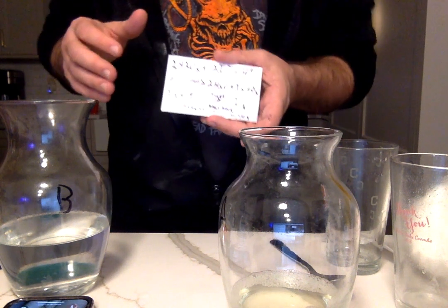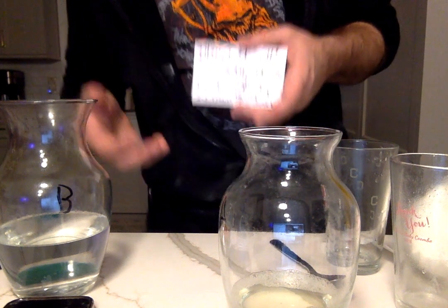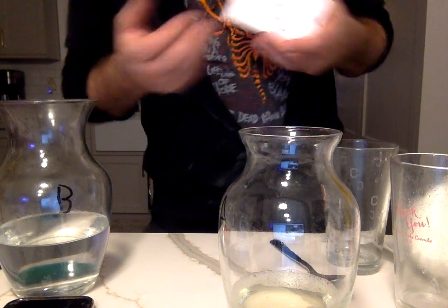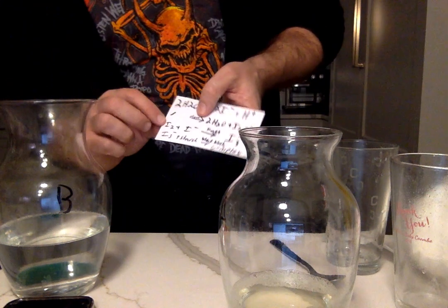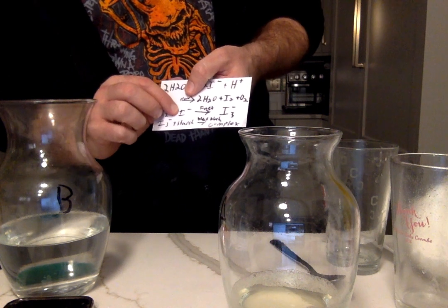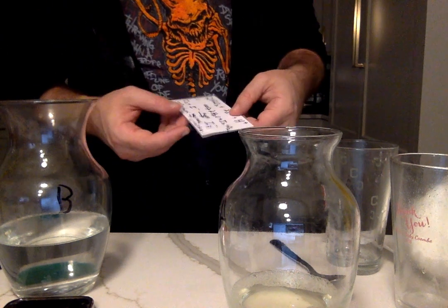There are different sources of error you can have. If there's too much vitamin C, it'll take a lot longer for the reaction to happen. If there's too much iodine, it'll happen a lot faster. Also temperature-wise: lower temperatures, slower reaction; higher temperatures, faster reaction. When it comes to the fast reaction, we have I2 with an I minus charge that will become triiodide, so it should be a quick color change.